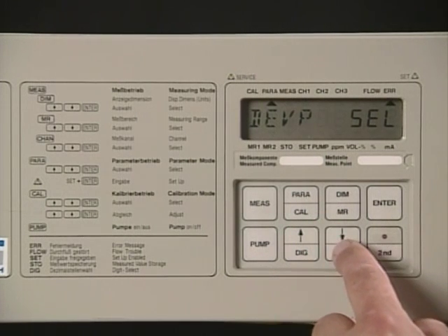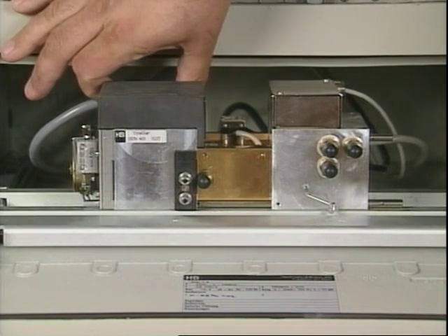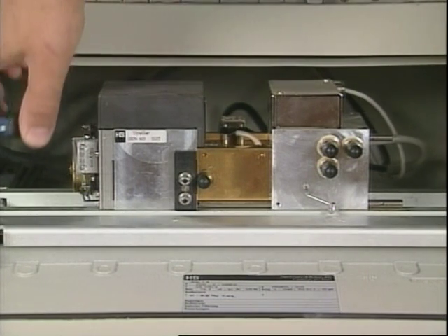Sometimes the chopper wheel motor can fail or go out of sync. Problems caused by chopper wheel motor failure may be indicated by an incorrect or lack of response from the analyzer. If the motor has failed, replace it.